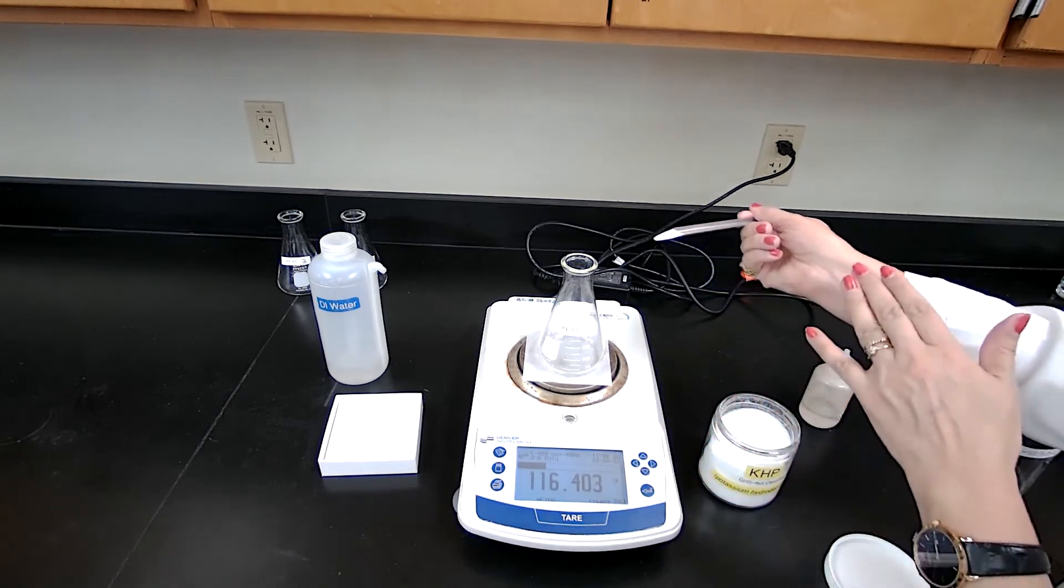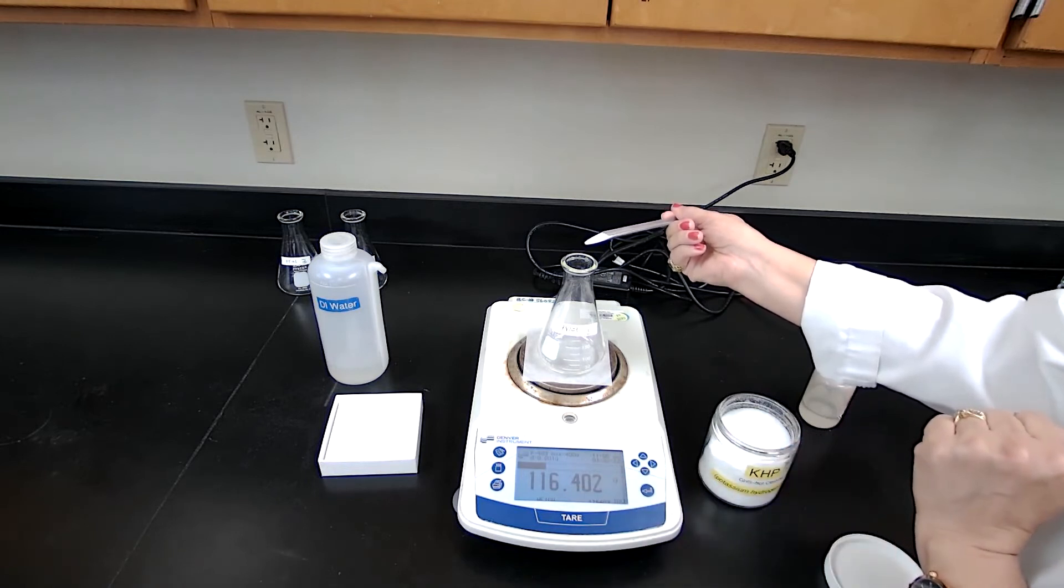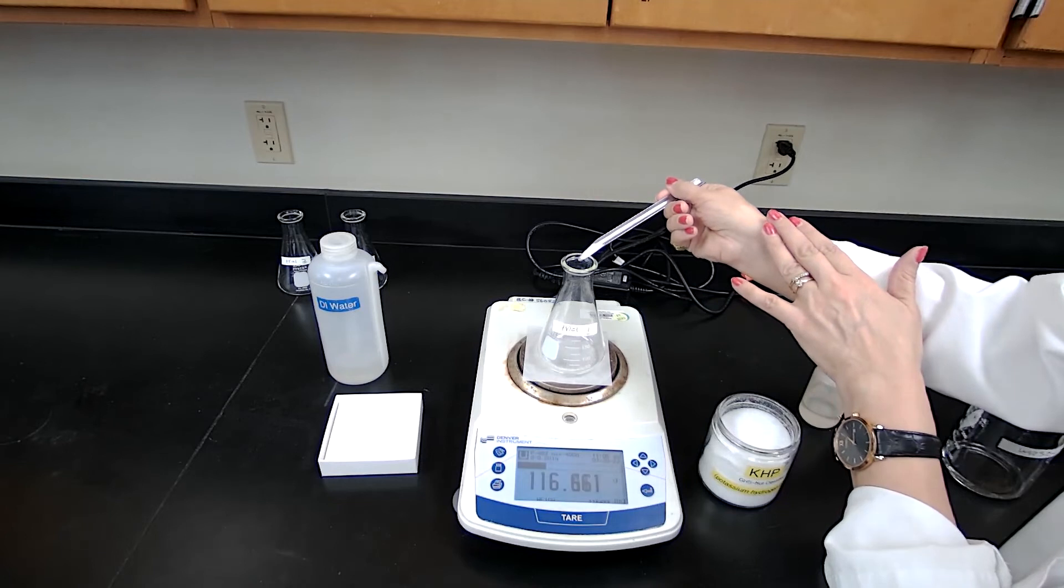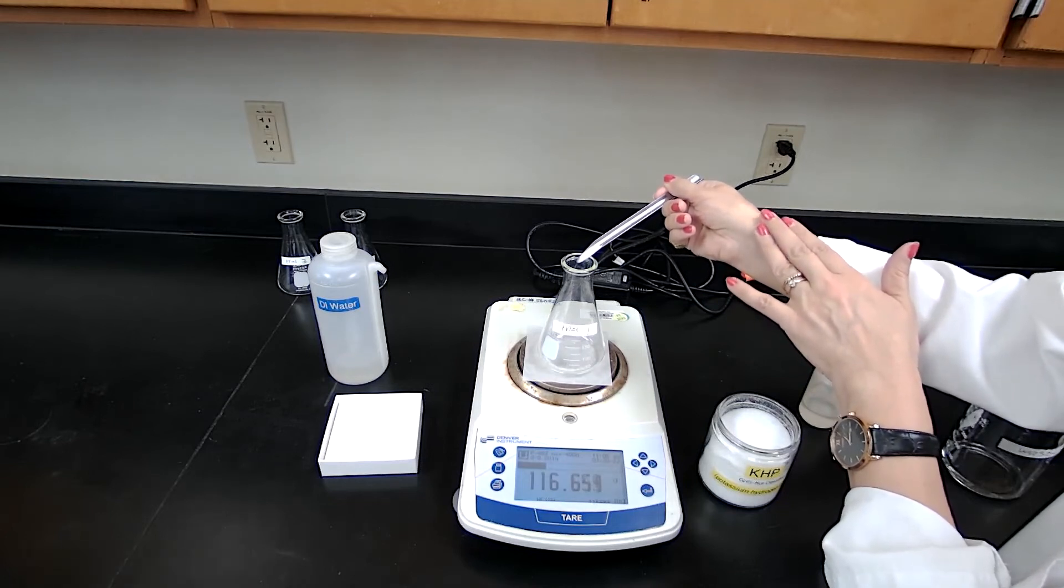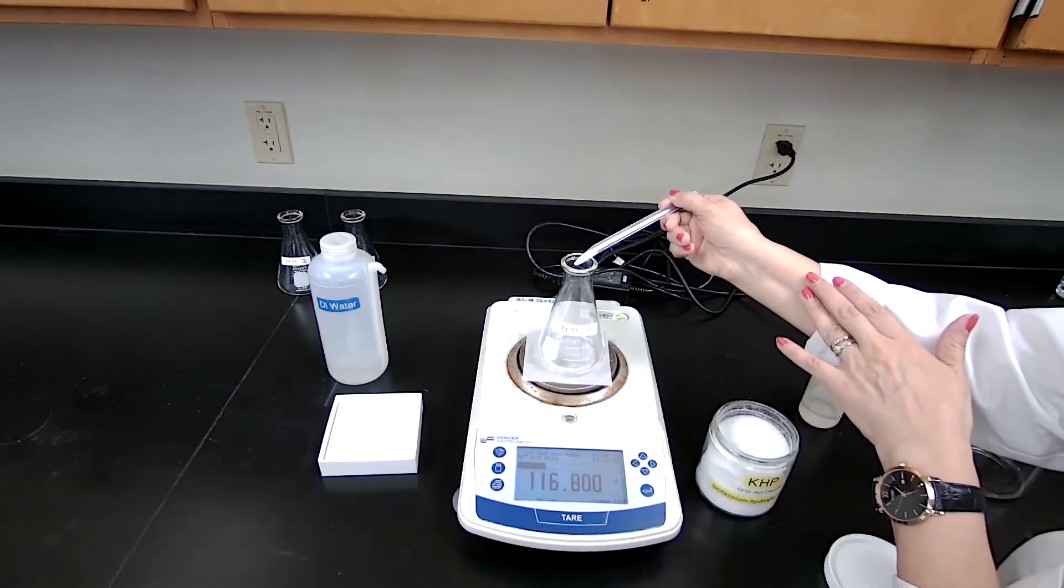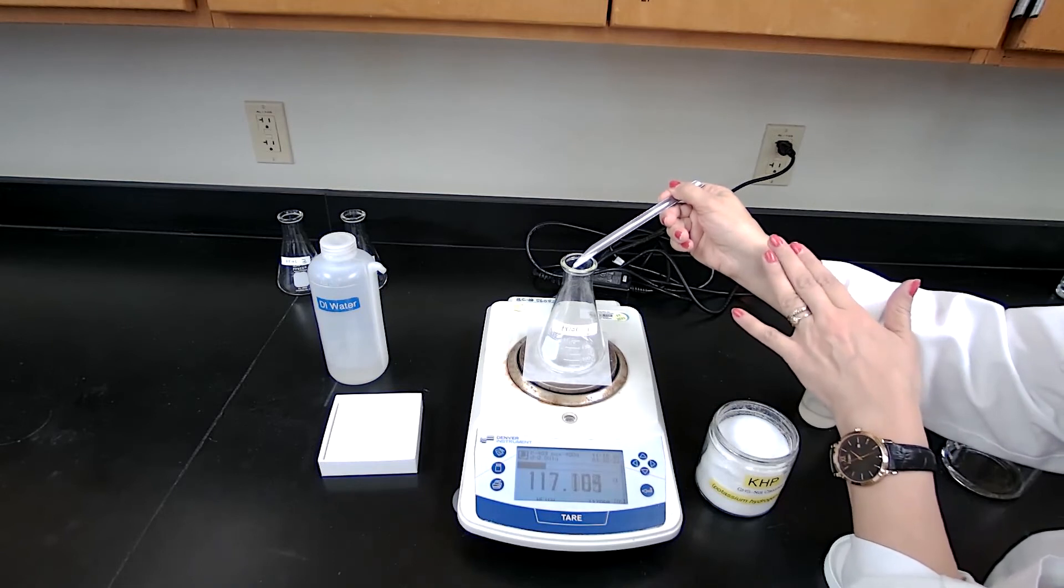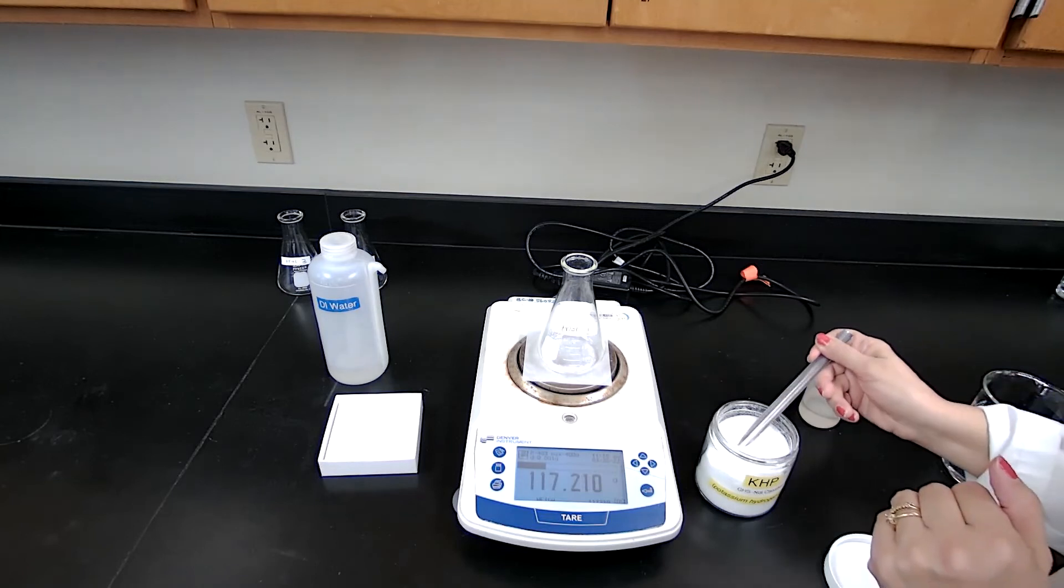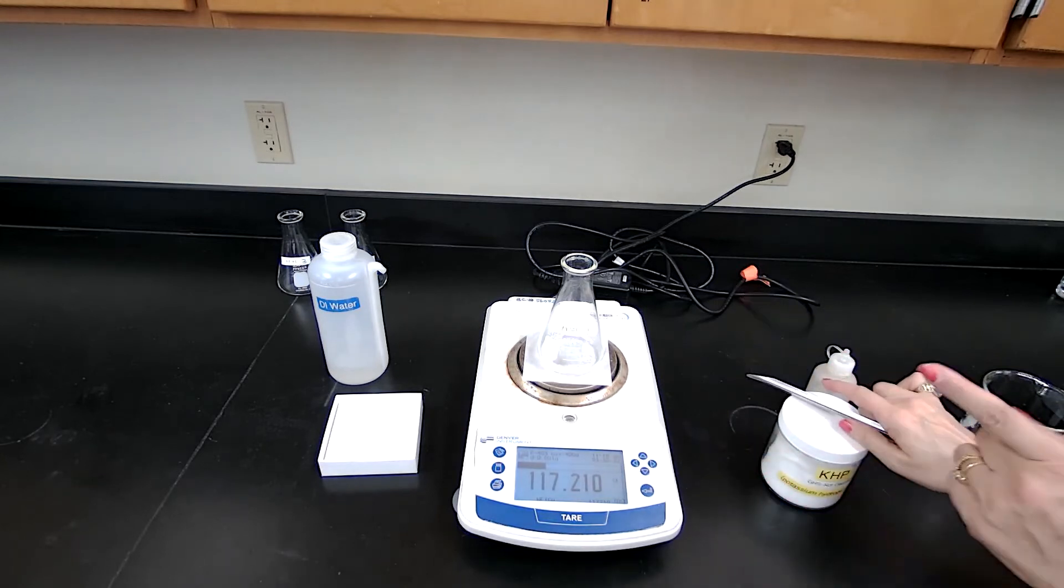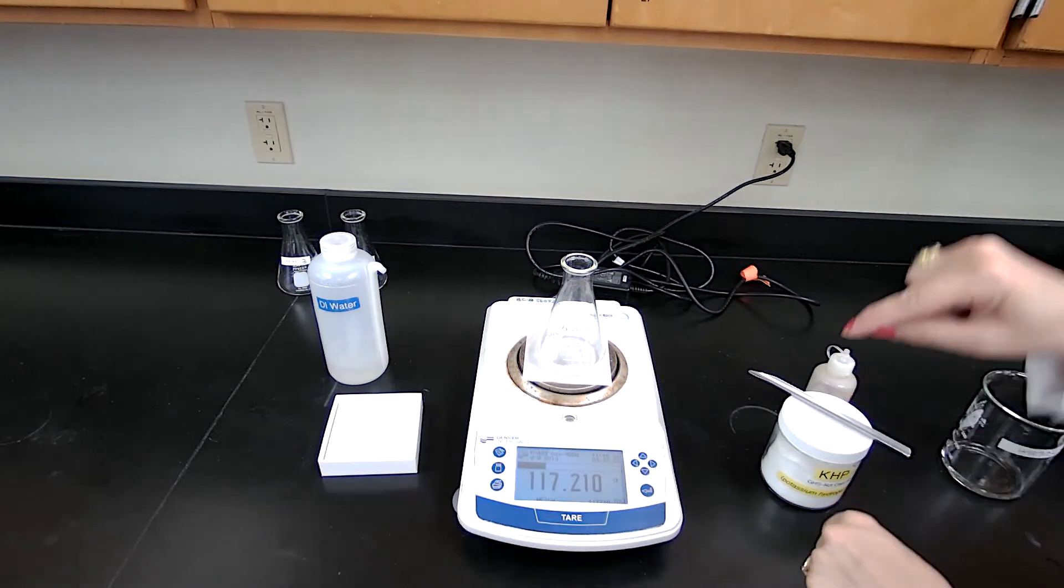Then I need 0.8 gram. So if it's 0.8 gram based on the procedure, we can go anywhere between 0.75 to 0.85. So this should go to 117.2 about that. So I would add slowly. So we are going to add until 117.2 and no more than 0.3. So that's it. Let's record this number as the mass of the flask plus the KHP for trial one. And I hope that you can see it. Right? So that's the first trial one.